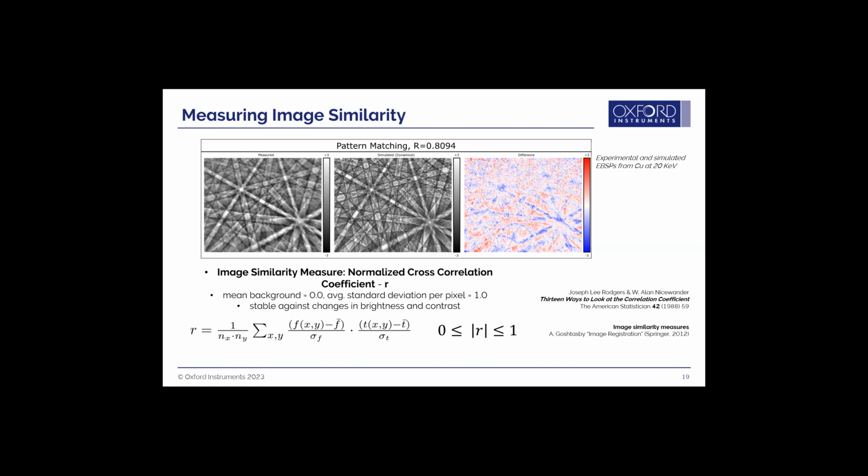So we get things on a normalized scale, and then it's just a straight-up matchup of the two patterns. What we're showing in MapSweeper in blue is an indication of a case where the actual experimental pattern is a little bit brighter. In the case of red, the simulated pattern's a little bit brighter. And if you care to dig into the research a little bit more on cross correlation factors, there are some citations there to go with.